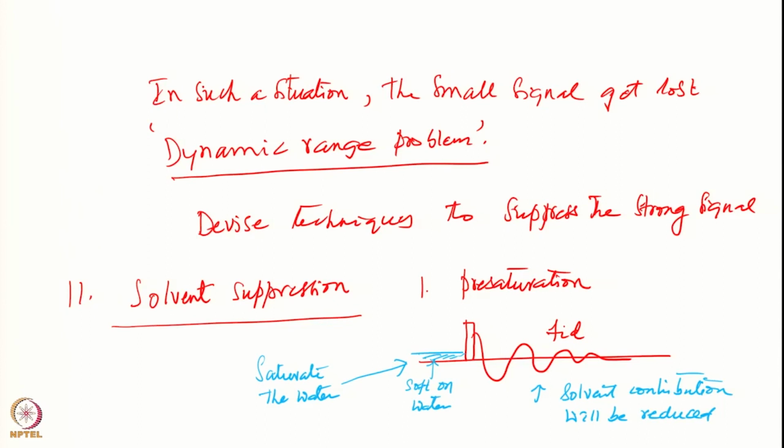methods. We will see what is called the inversion recovery. We will see the next experiment, which is called the inversion recovery. Let me call this A. Then I will say B. B is inversion recovery. Inversion recovery technique.